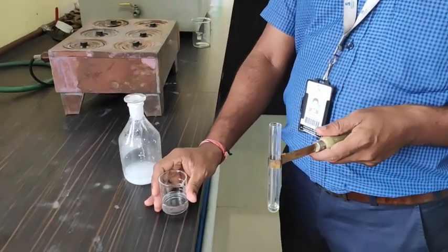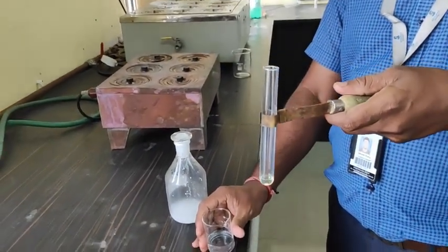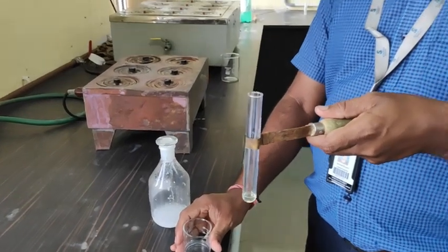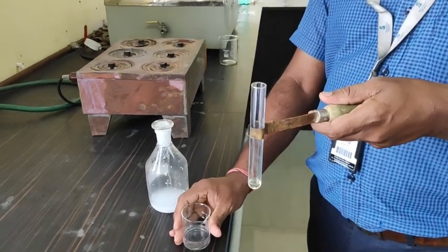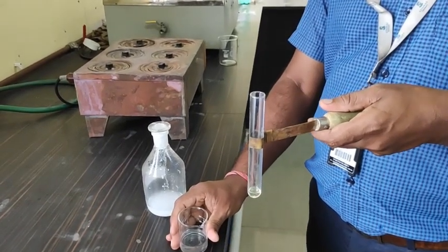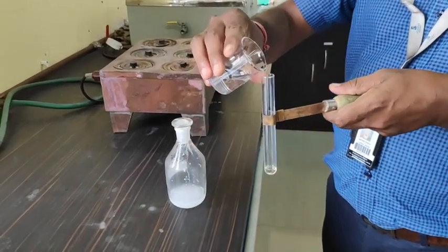First, now we have taken a sample in the test tube. As this experiment will require some amount of heating, Devash is now using a special type of apparatus known as a test tube holder, so that the heat does not get transferred into his hand. So now he is adding some amount of sodium hydroxide.